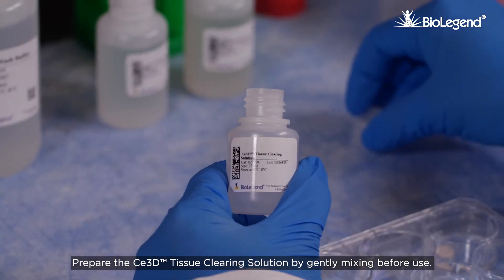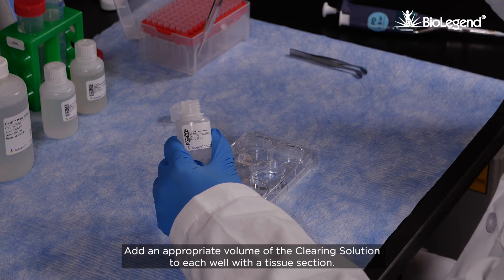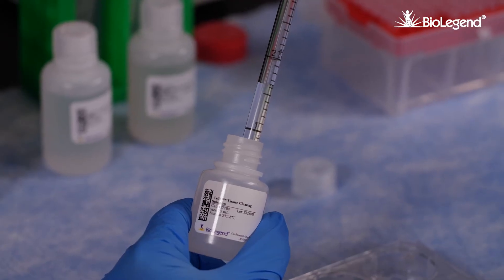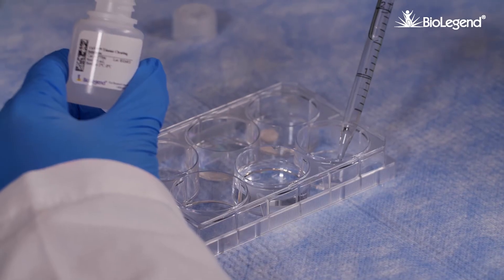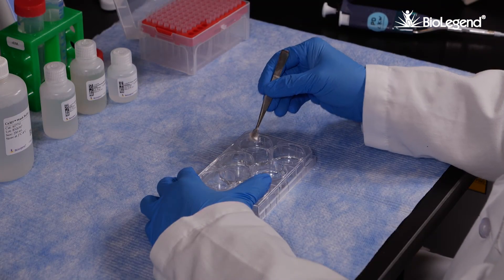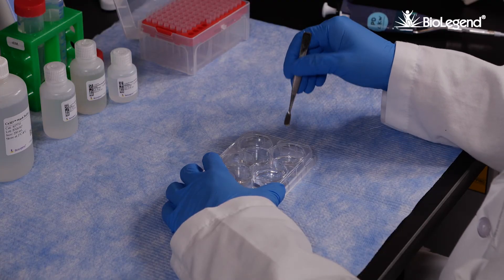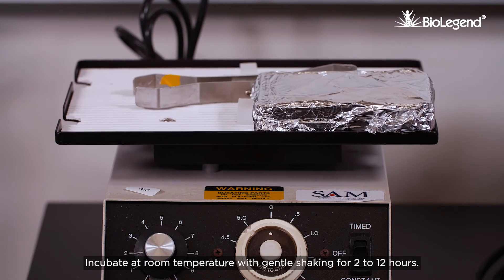Prepare the C3D tissue clearing solution by gently mixing before use. Add an appropriate volume of the clearing solution to each well with a tissue section. Incubate at room temperature with gentle shaking for two to twelve hours.